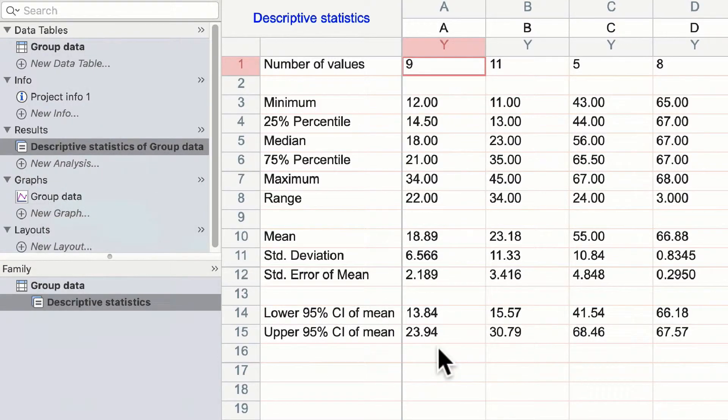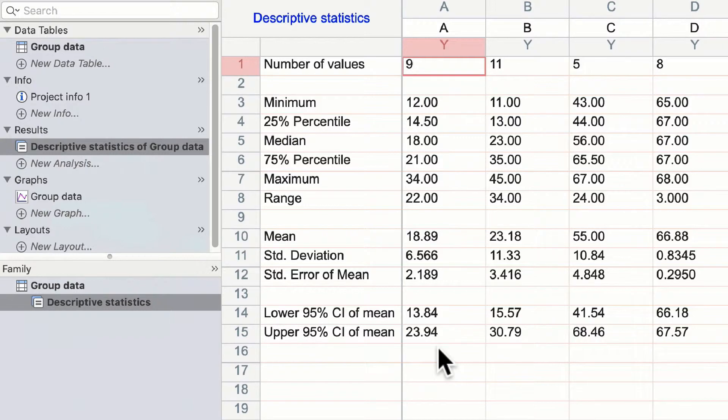The descriptive statistics window is self-explanatory. You can see divided A, B, C, and D, the descriptive statistics that we requested.